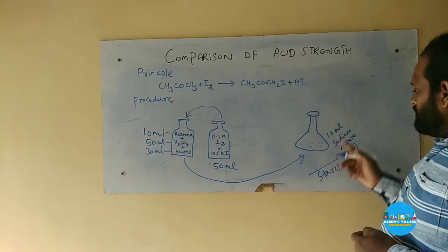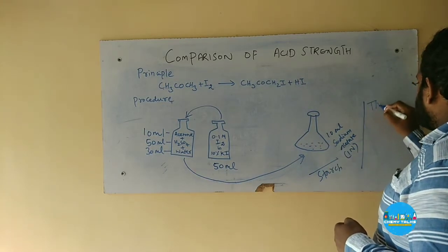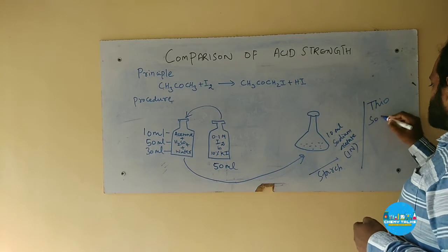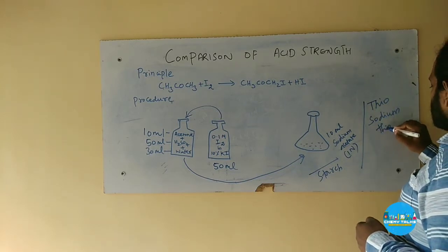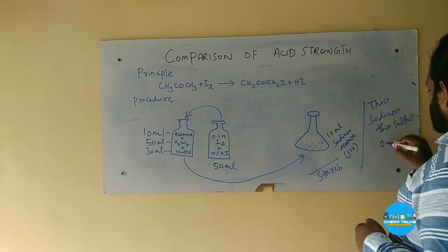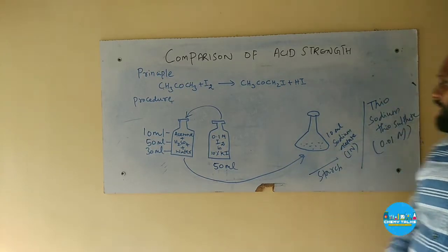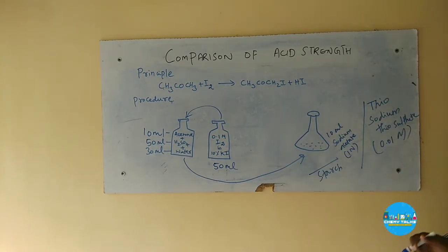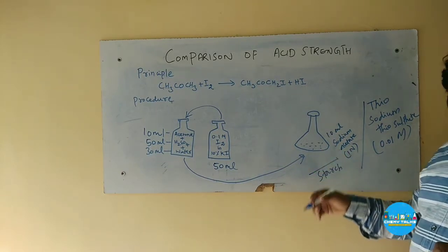This solution is titrated against sodium thiosulfate of concentration 0.01 molar. The end point is the change of deep blue color into white color.